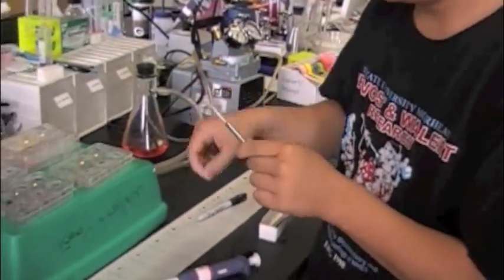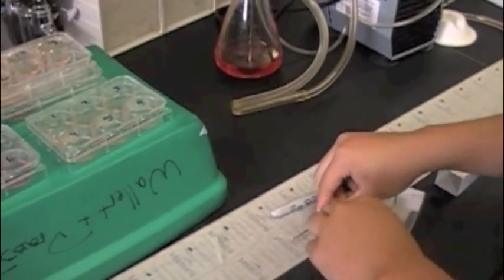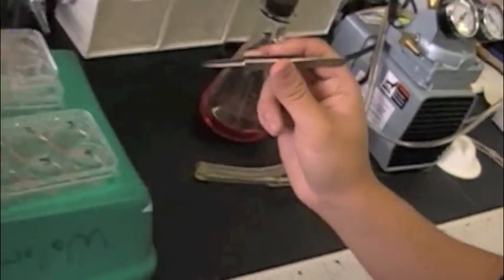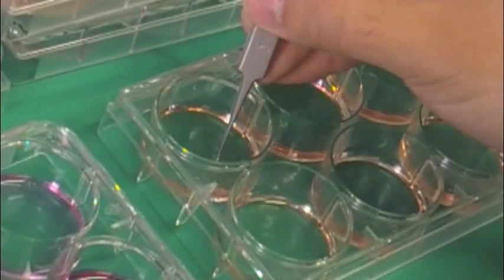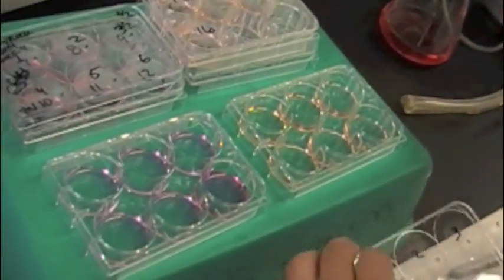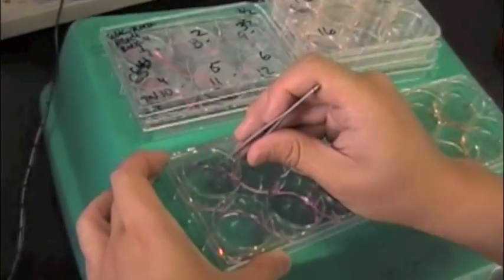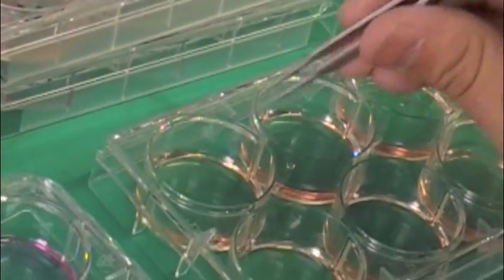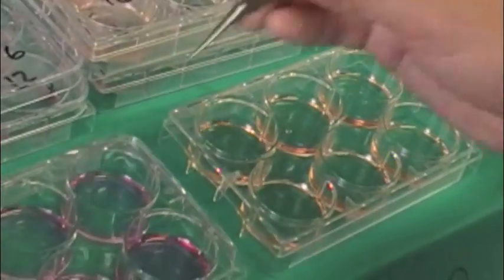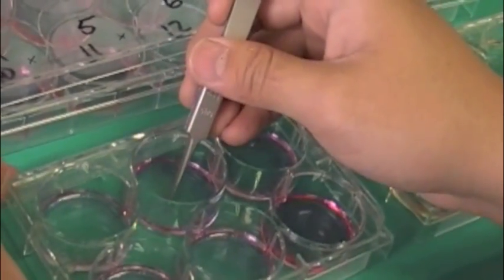You can use specialized forceps with a bent tip to make it easier to pick up the cover slips. Transfer the cover slips from your old wells, grabbing them gently and placing them face up into the new wells as before. Keep doing that until all cover slips are transferred. Also make sure the cover slips are submerged under the fixing media and that they don't overlap each other.